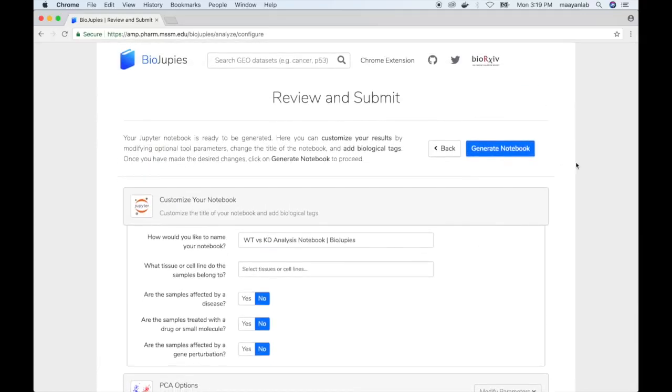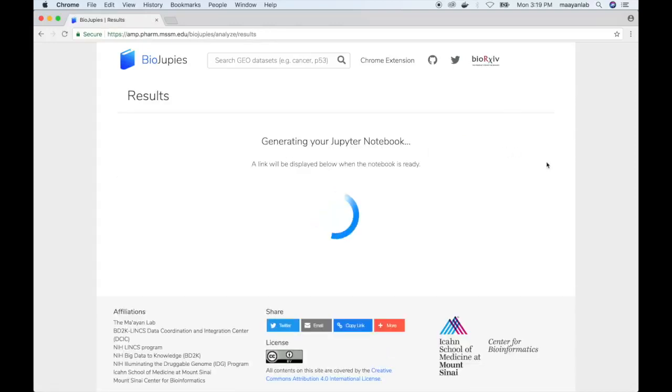Once the user has selected the desired settings, they can then click on generate notebook to launch the notebook generation job.